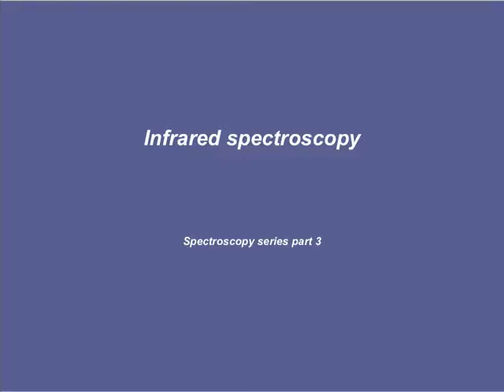For our final part of our spectroscopy series, we're going to look at infrared spectroscopy. This is kind of the third piece of the puzzle, alongside mass spec and NMR, of methods that are going to allow us to determine the structure of organic molecules.